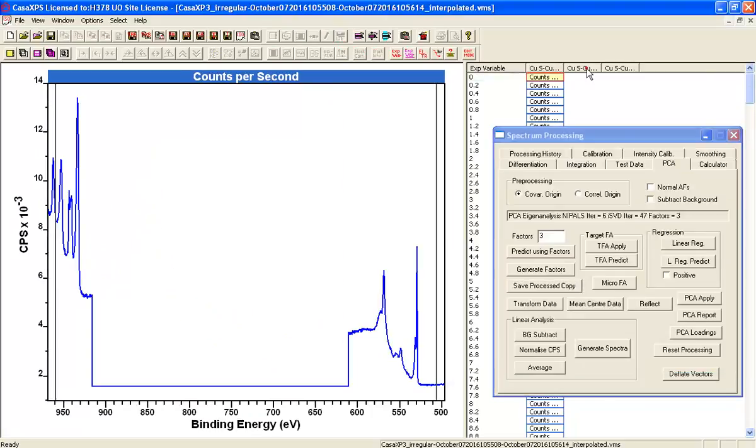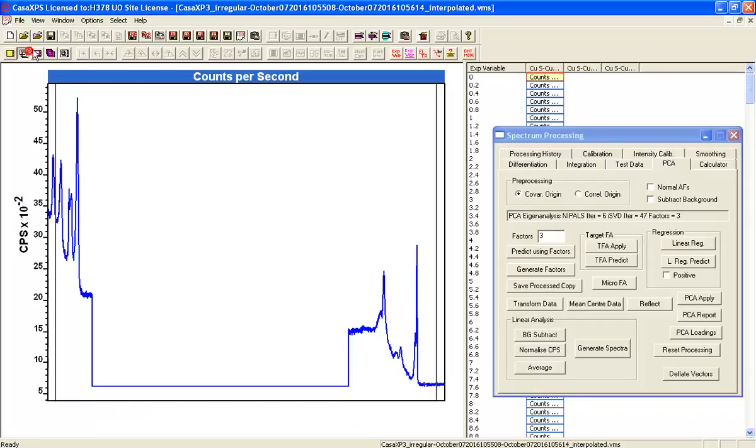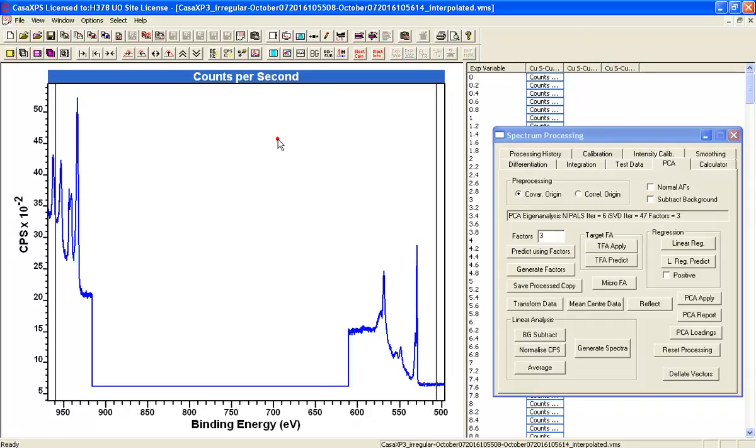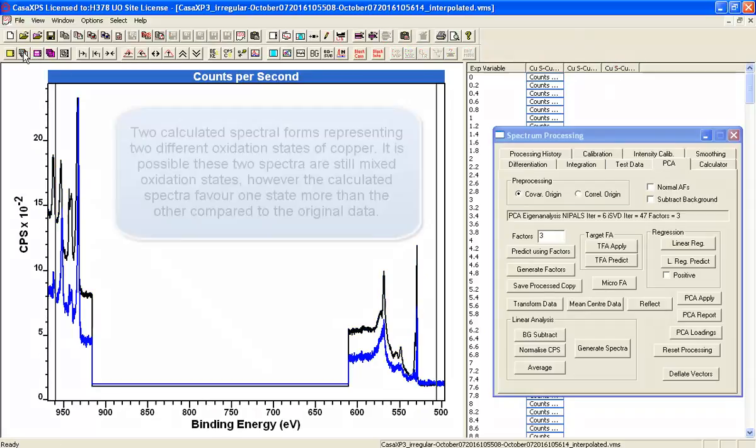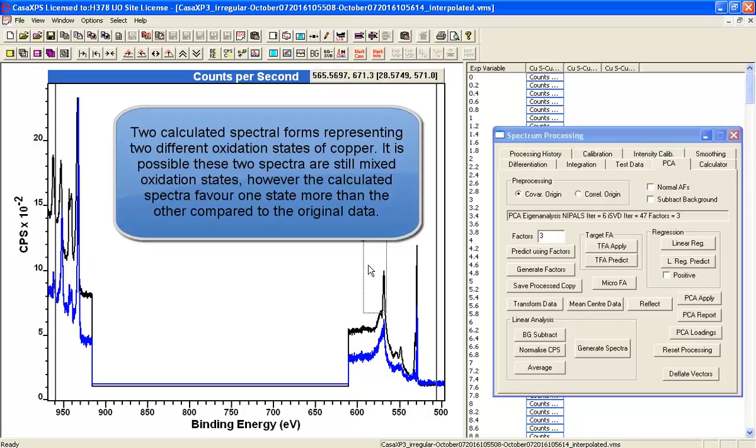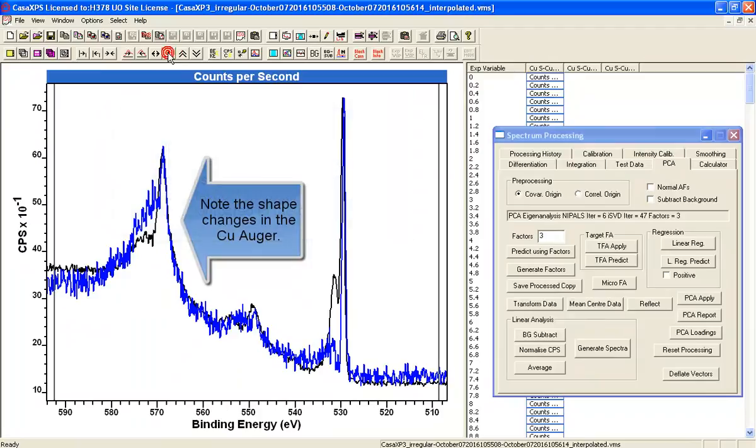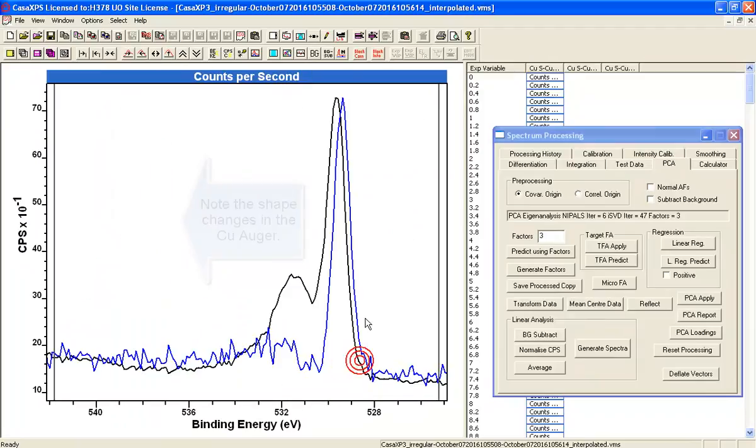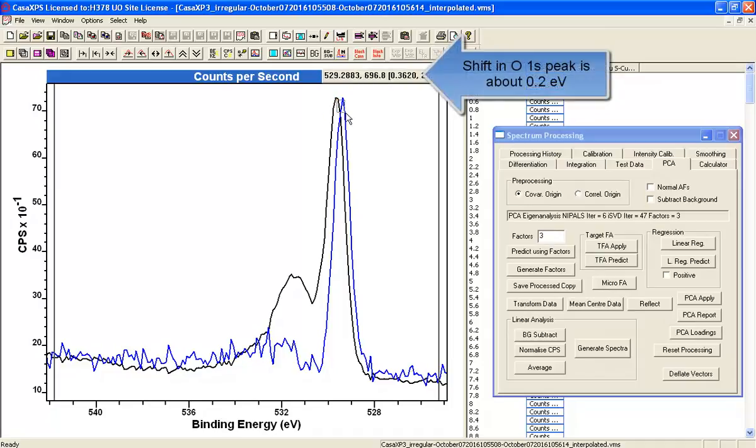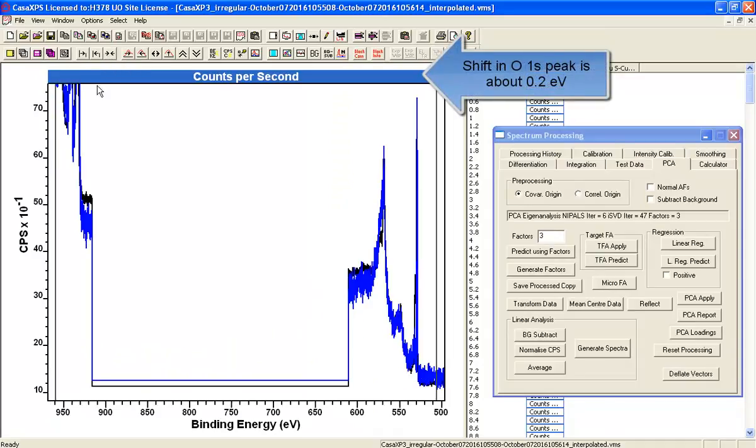So we've now got two spectra representing two different materials that, when combined, give us the material that we've been measuring using XPS. So that's what the Oxygen looks like. And that's got a shift of about 0.2 eV.